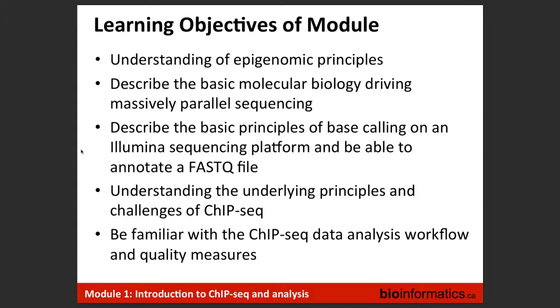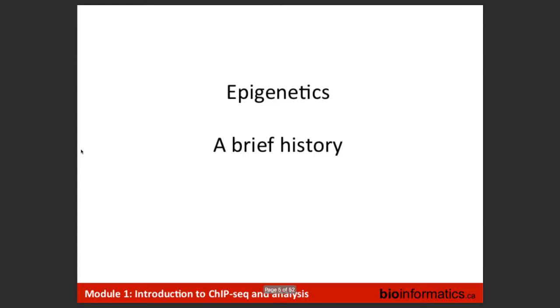I'm going to talk about understanding some underlying principles and challenges of ChIP sequencing. Again, looking more from the wet lab side of things, but then get into some of the dry lab measurements that we use. And then a very high-level overview of the analysis workflow that will then feed into module two.